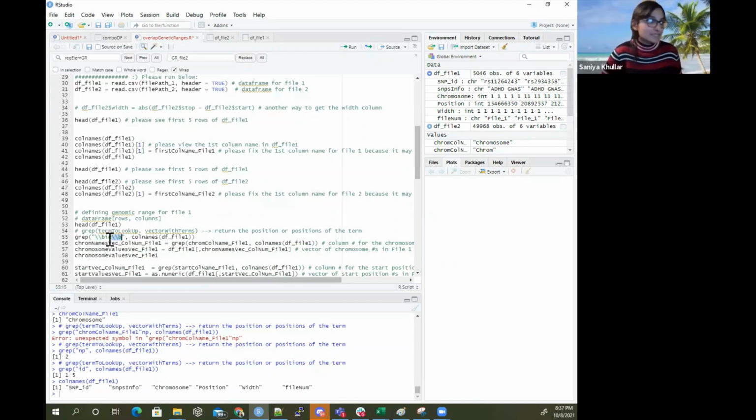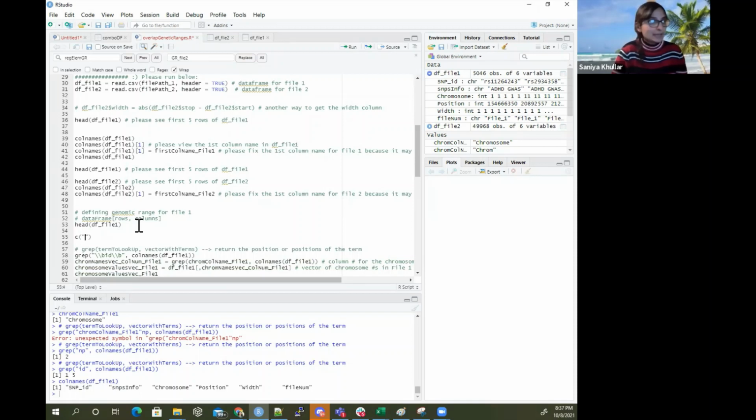Like if I'm looking up SNP, and let's say that this was SNP's info and then this was SNP underscore ID, or this could be SNP in caps. Let's say that we had SNP, and then we also had SNP info, and then we had other info. Let's say we had this fake vector, random vec, equal to this, okay?